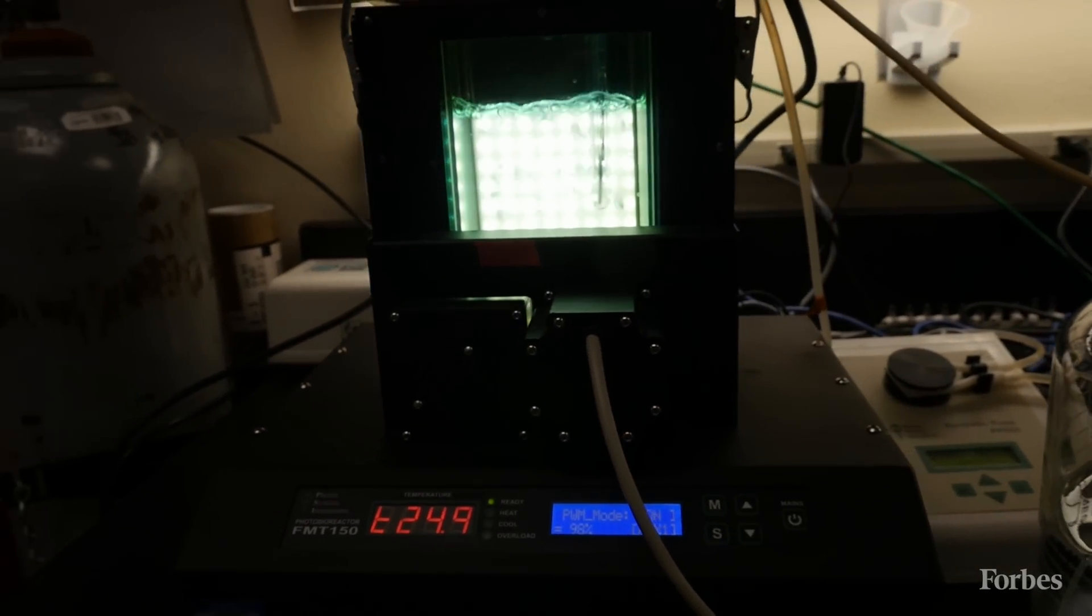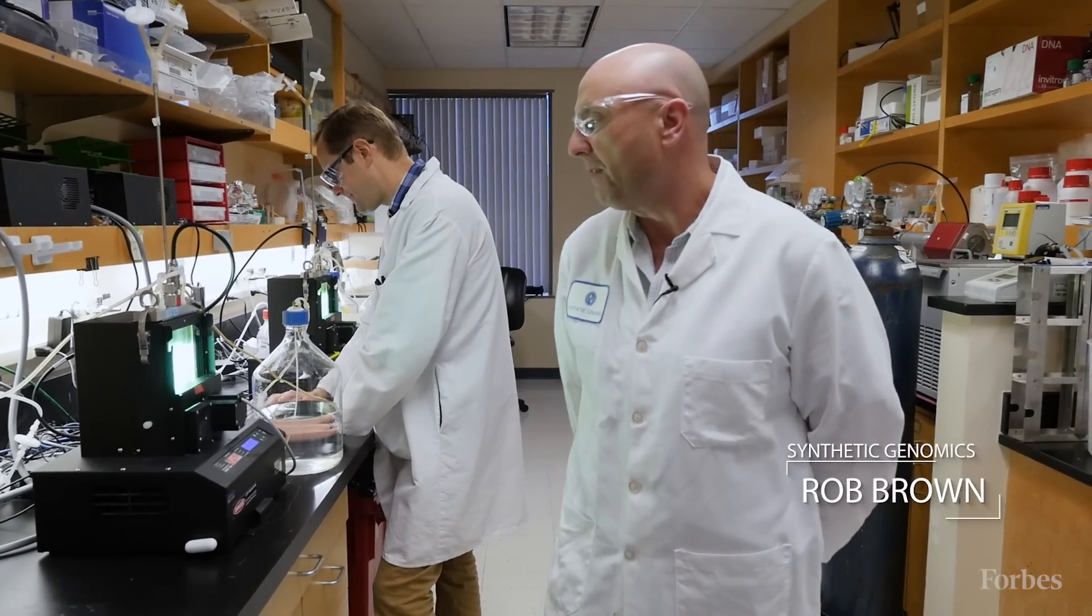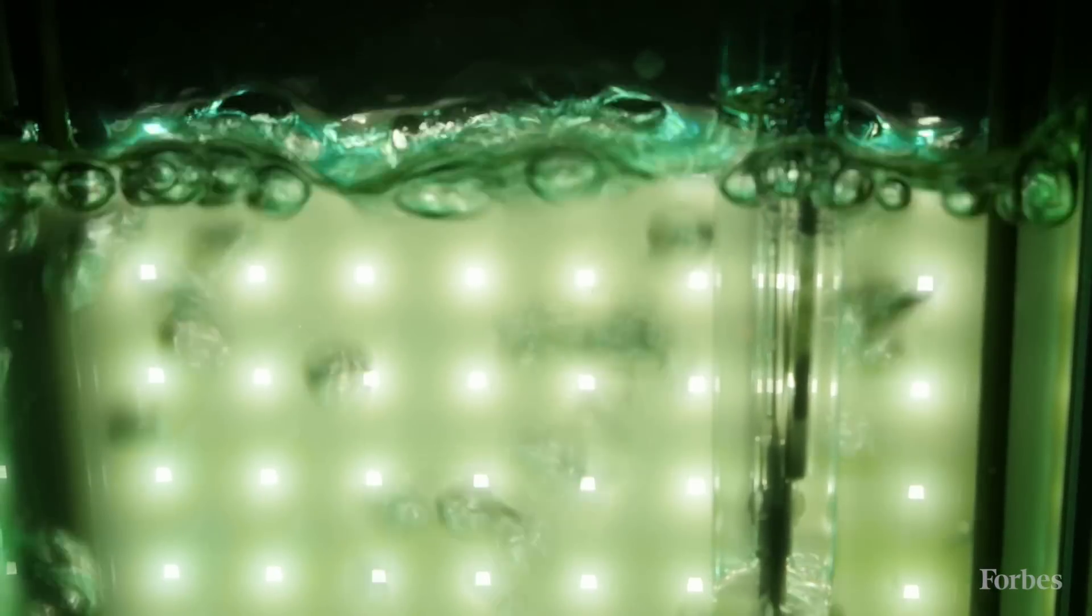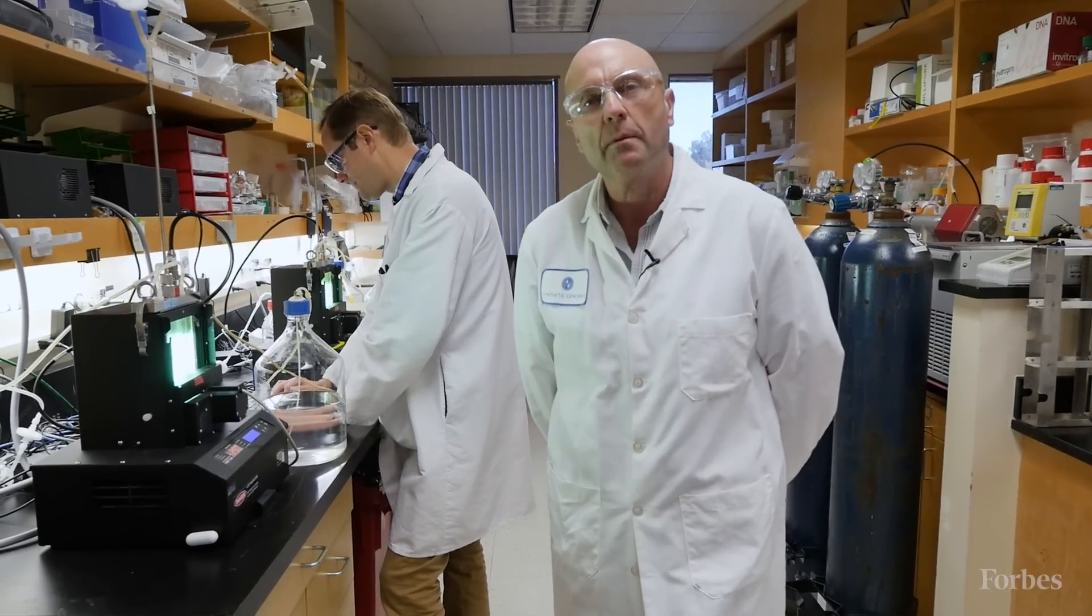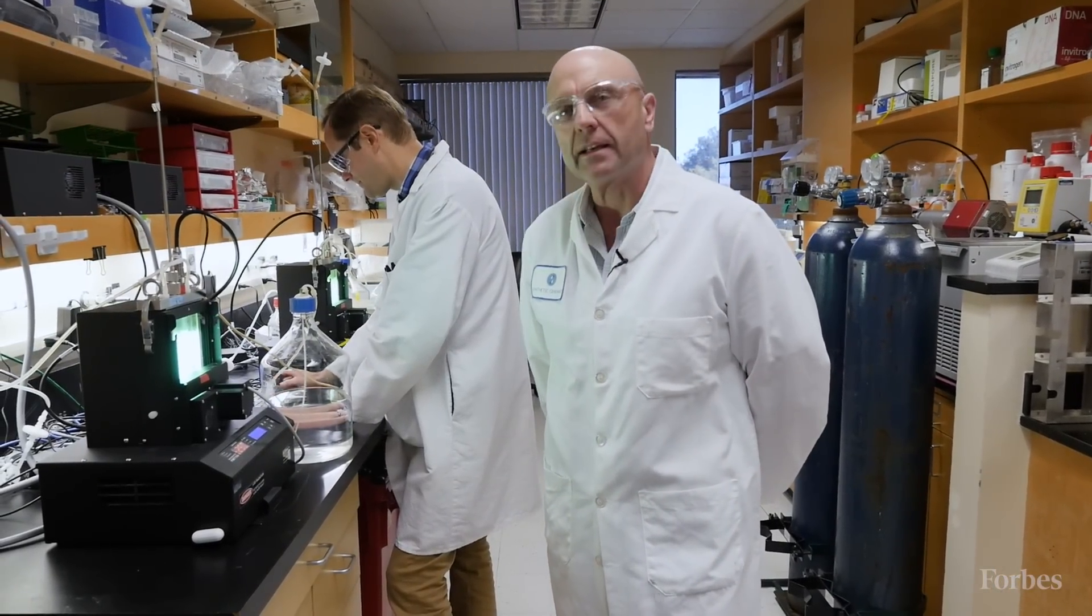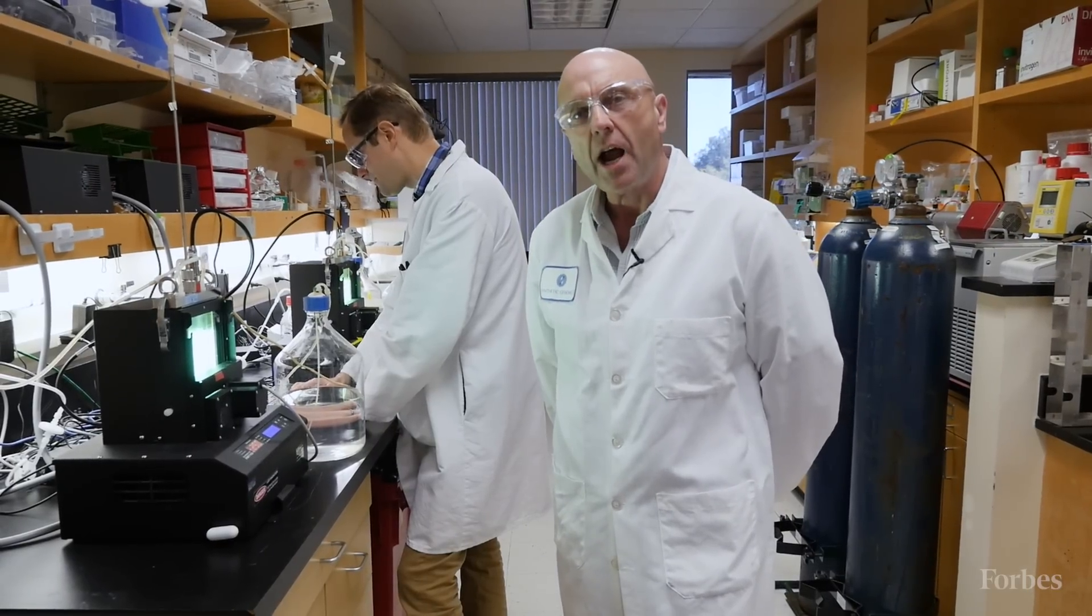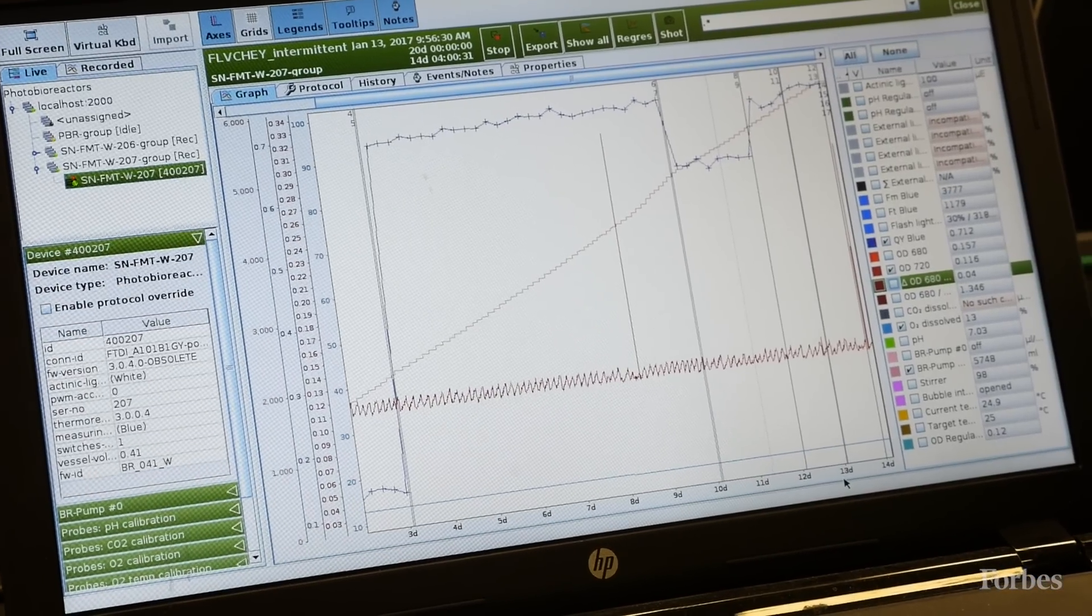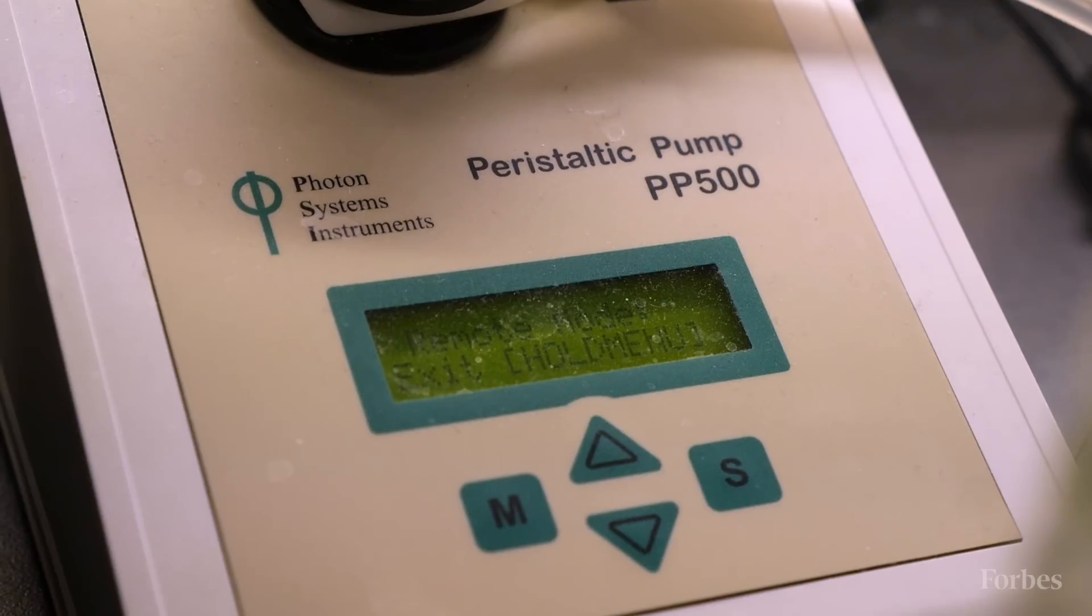This is what we like to call our algal treadmill, and what we're doing here is an advanced evolution experiment. We take our natural algal strains, put them in this turbidostat or photobioreactor, and basically put them on almost like a treadmill. We accelerate the dilution rate, and only the guys who are fat enough and fit enough to keep going within this vessel will proliferate. The guys who are slow or unfit will be washed away.